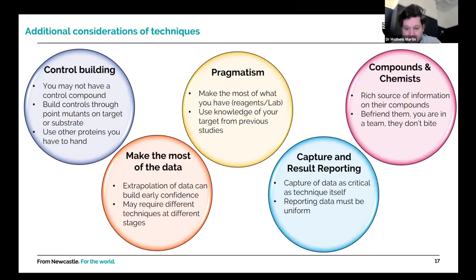But also understand that you may need to use different techniques at different stages in the campaign, where the technique you validate your hit from may not serve a purpose in the full make-test. I always encourage you to be pragmatic and make the most of what's around you in your lab. Regarding reagents and other labware, use knowledge of other experiences that you have with your target, such as the buffering and purification or the DMSO tolerance in your crystallization to help inform you.